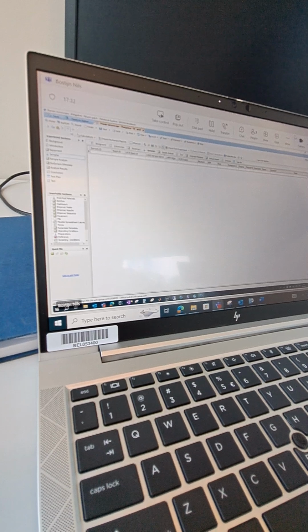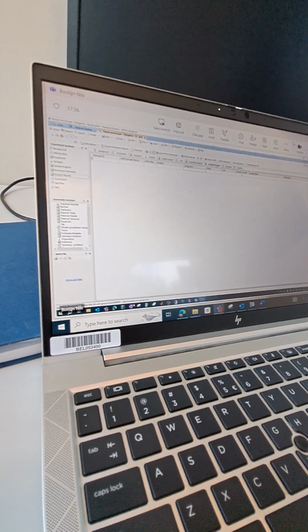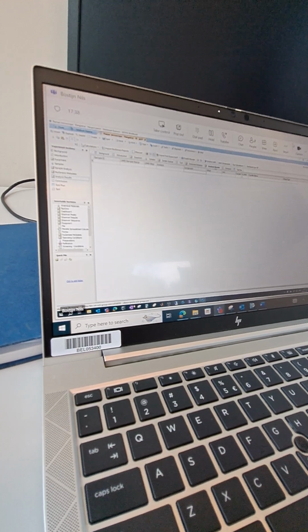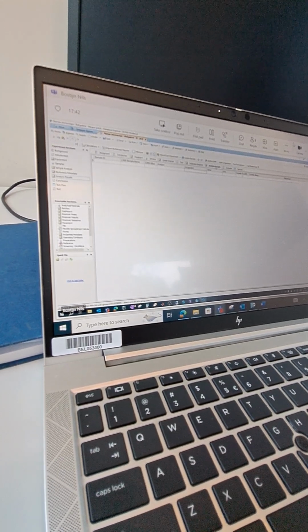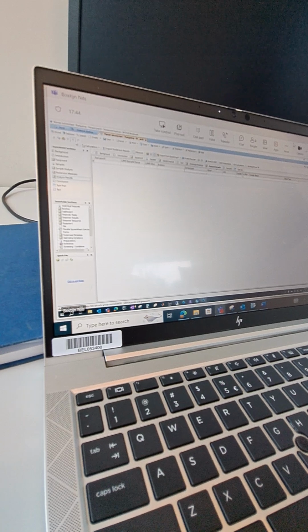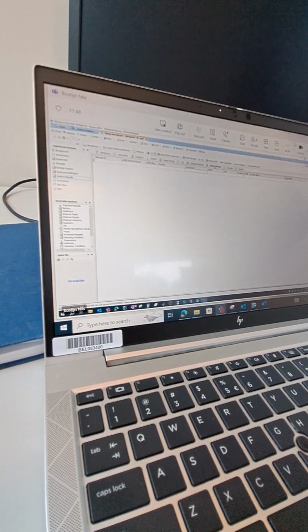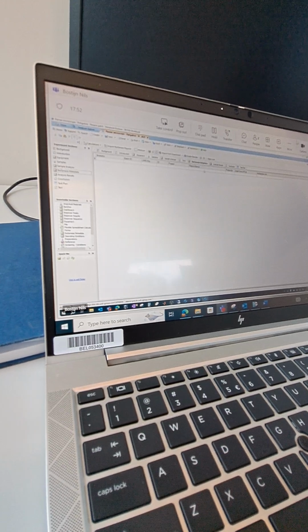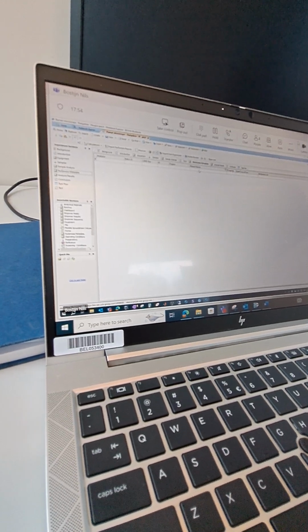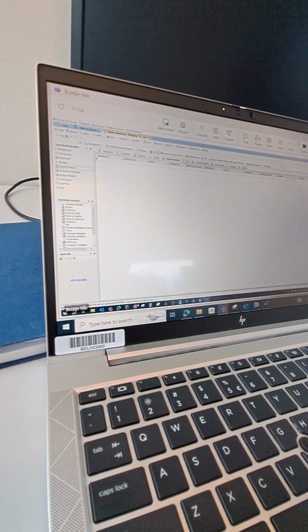Then we have samples, sample analysis, and analysis results. This you don't need to think about. This is more if we use the ELN connected to other software. Here, for you, it's not important. So you can forget that. And also the new Genesis metadata, don't think about it. Okay. And then normally the text section is not here.